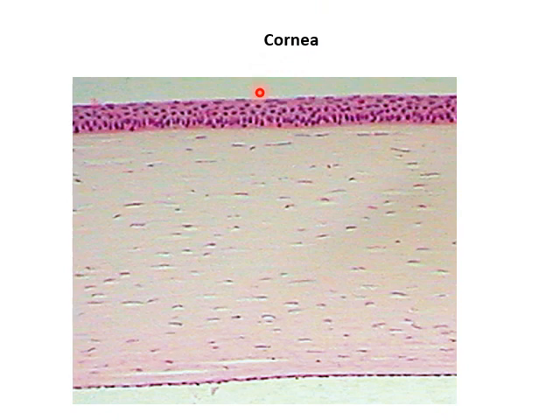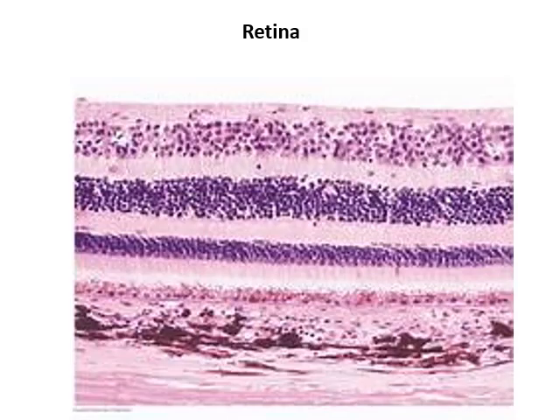Cornea, formed of 5 layers: epithelium, Bowman's membrane, then the substantia propria. The epithelium is non-keratinized stratified squamous epithelium, then the Bowman's membrane, then the substantia propria, and these are the keratocytes, then the Descemet's membrane, then the endothelial cells.